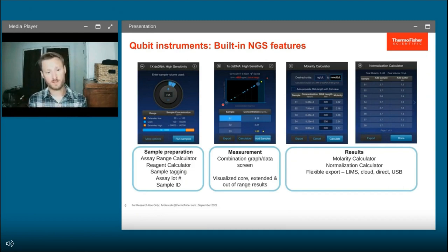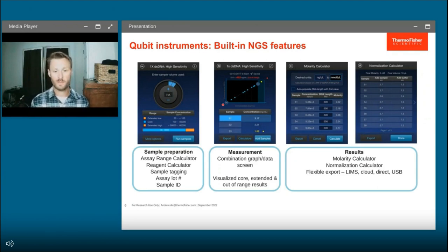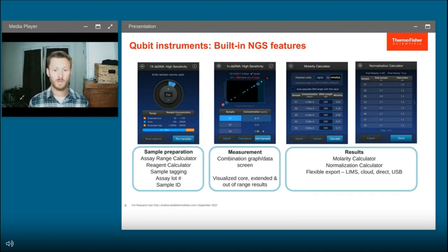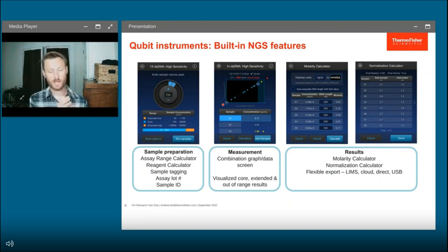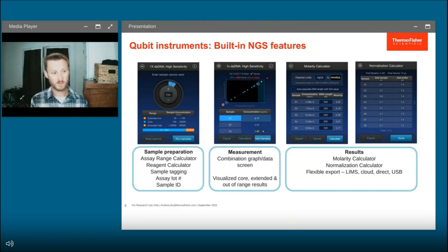On the flip side, if your sample is too high and outside the sensitivity range, you might want to consider further dilution, or switch from a DNA high-sensitivity assay to a broad range assay. Other downstream features include the molarity calculator: if you've determined your DNA length using electrophoresis like a TapeStation or Bioanalyzer, you can input that length and convert concentrations into molarity. You can also use the normalization calculator for sample pooling — for example, setting a final concentration of 5 nM — and the system will calculate the recipe for you.